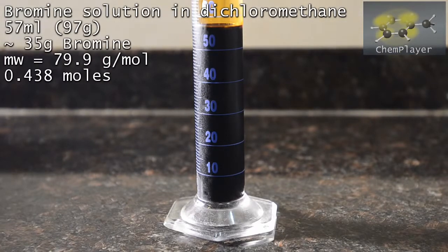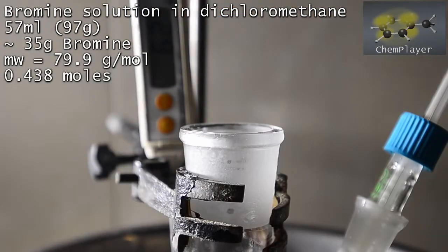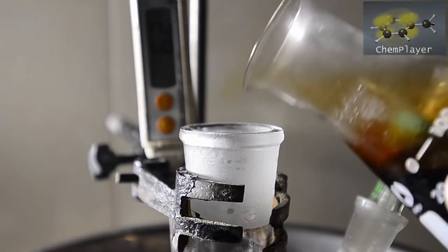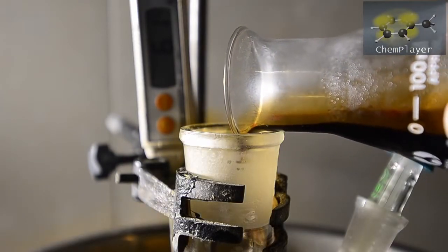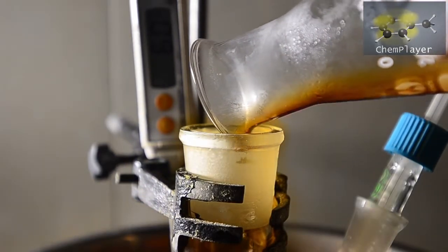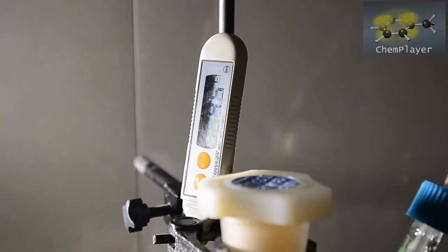We have 57 ml of solution, which weighs 97 grams. Doing some maths we can work out that this contains approximately 35 grams of bromine. So first we'll add this to the flask. Okay, here we go. The temperature in the bath and in the flask is around 5 degrees C.